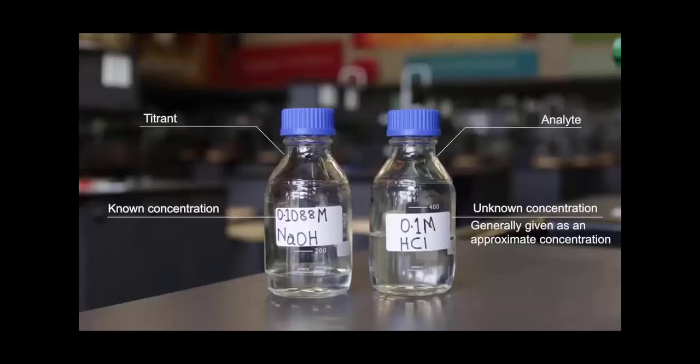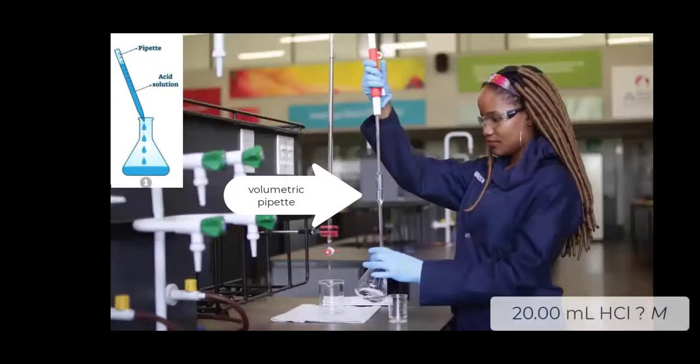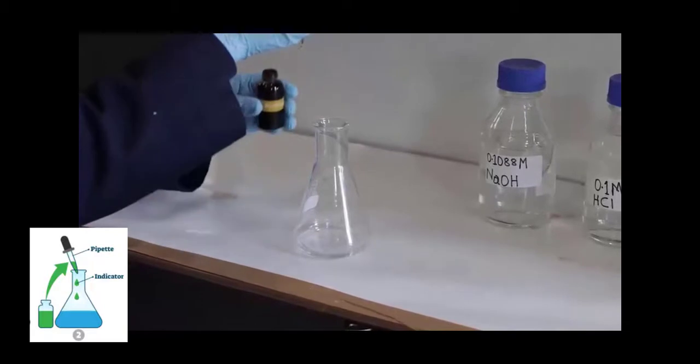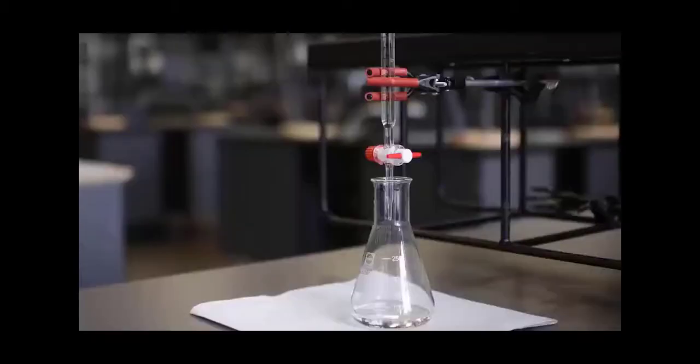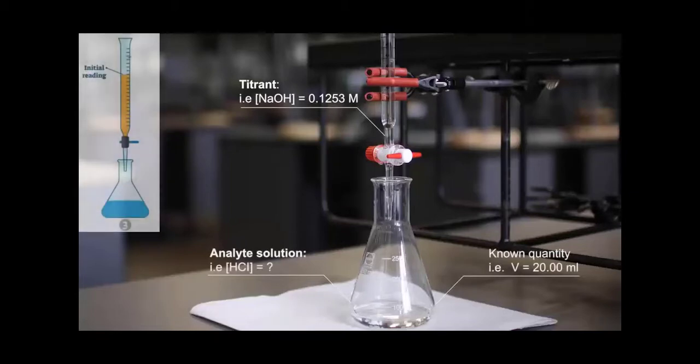We'll use a volumetric pipette, which is very accurate. We can get 20.00 mLs of that unknown acid into a flask. Then we'll add some indicator. In this case, they've added some phenolphthalein. So we're starting off with our analyte, our HCl of the unknown concentration. We have 20.00 mLs of it. And we're ready to add sodium hydroxide.